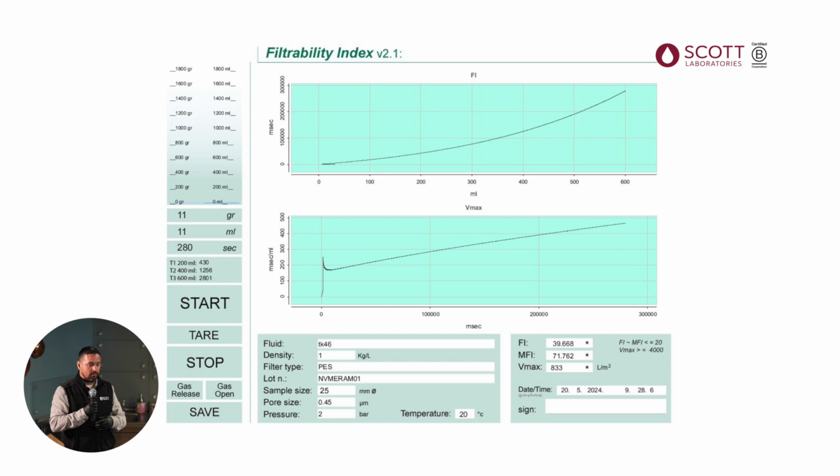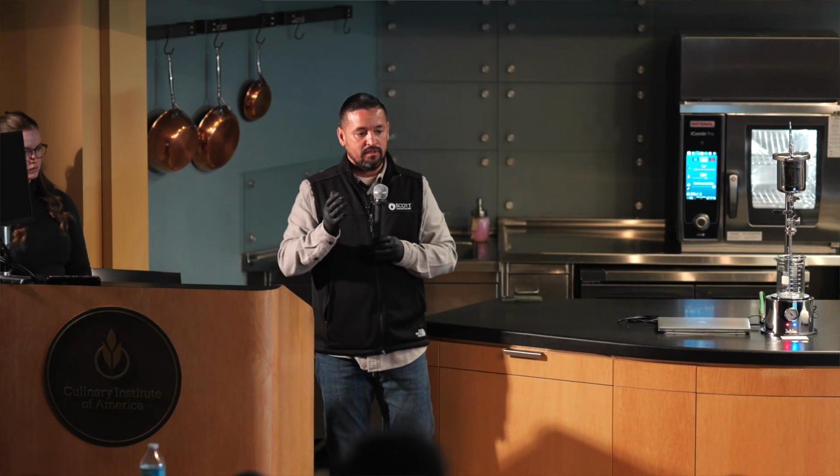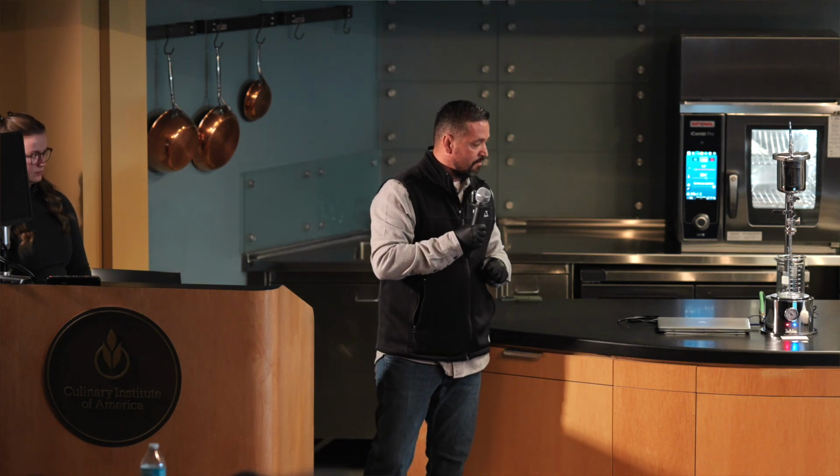This is a result where, if I'm the winemaker, I'd probably say, hey, cellar, we've got to refilter this one, because this is definitely going to clog our filters. You're going to be frustrated. You're going to be changing out cartridges prematurely because the wine was just not ready to go through the filters. All this is basically preventing us from just sending that wine to the bottling line and being frustrated. So these are a couple different tests that we've done. I'm going to now do the demonstration, and yeah, that's it.